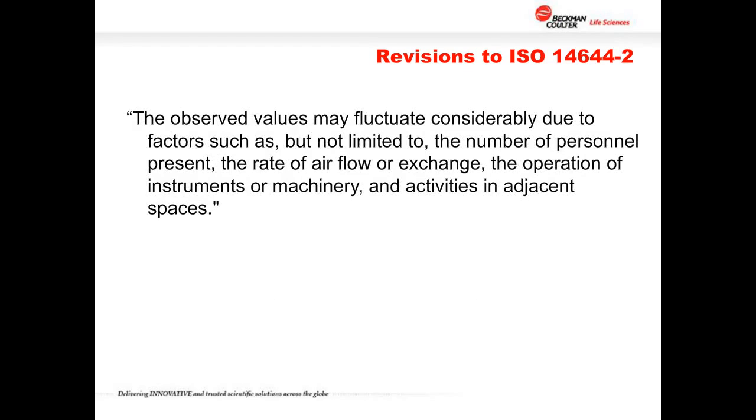This is the important reality of monitoring as opposed to classification. Observed values may fluctuate considerably due to factors such as, but not limited to, the number of personnel present, rate of airflow, operation of instruments, machinery, and activities in adjacent spaces. And this is really at the heart of the distinction, you might say, between classification and monitoring, in that we acknowledge that these spaces are somewhat dynamic, and it's certainly different in a space that has 3 people working versus 5 or 10 in the same identical space. We'll see different concentrations and signatures in the air particle levels.